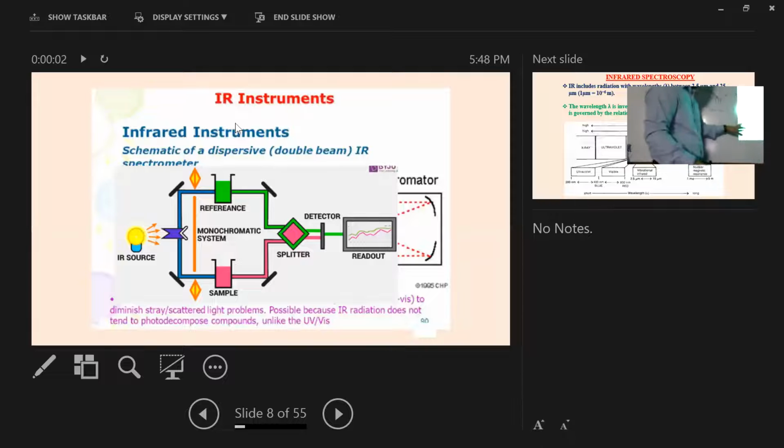Just when the modes of vibration of the molecule match with the light energy. That means light energy means the wavelength we are giving. So if our molecule is continuously vibrating at 1500 per centimeter, let us consider this is the energy of this water molecule bending.